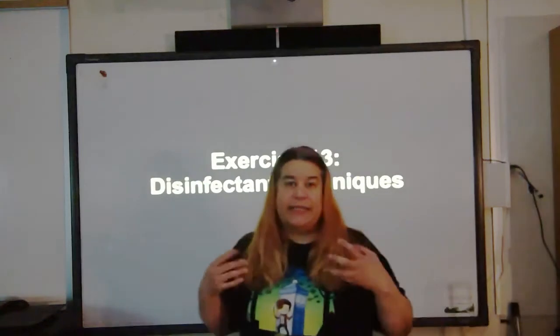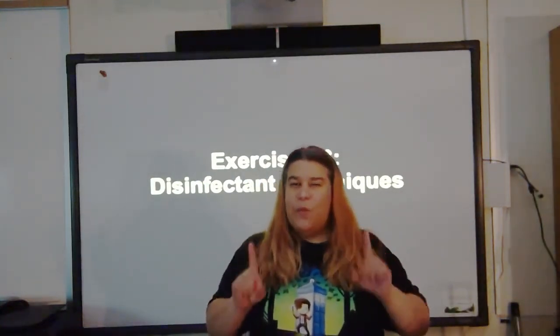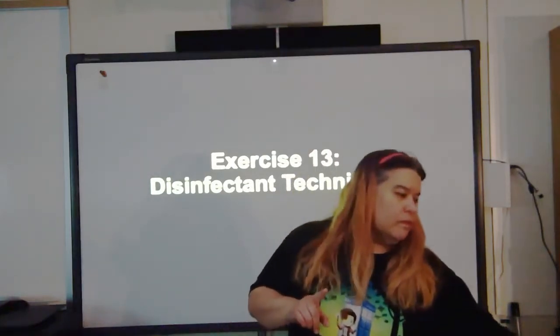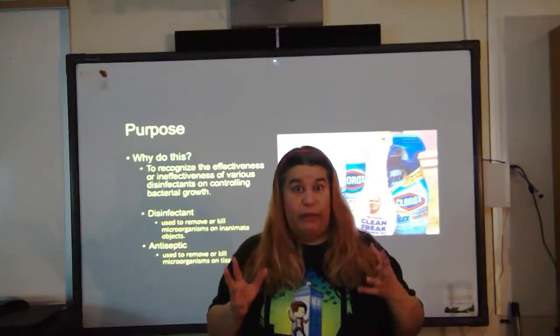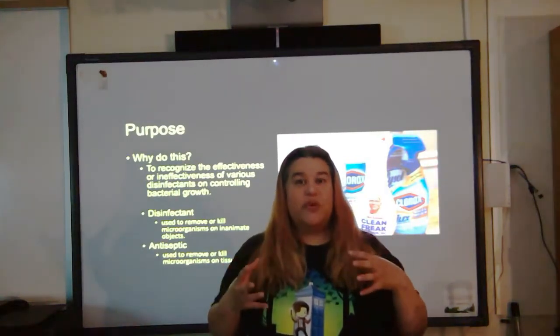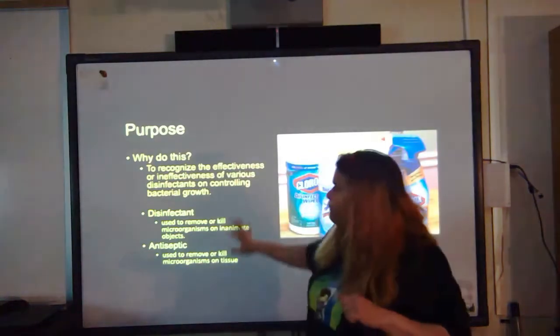Exercise 13 deals with disinfectant technique. One of the things that I want to point out, technically this is a misnomer for the lab, and misnomer means it's kind of a bad name. I'll explain, just give me a second.